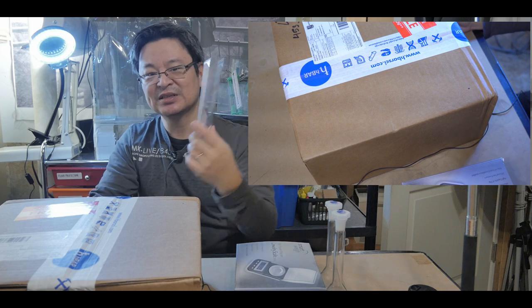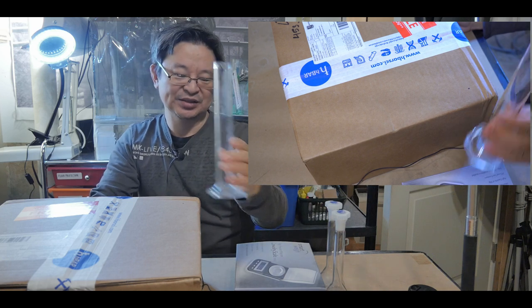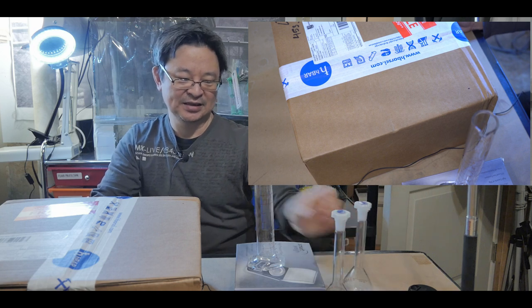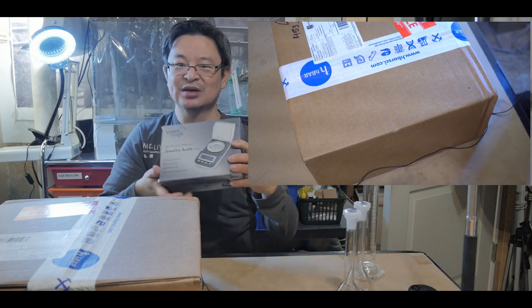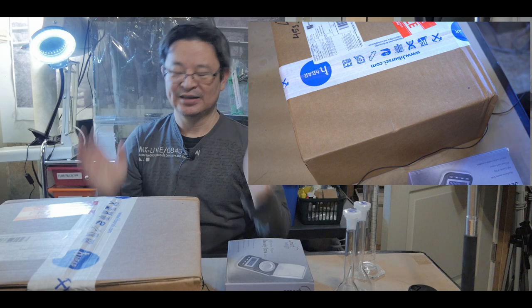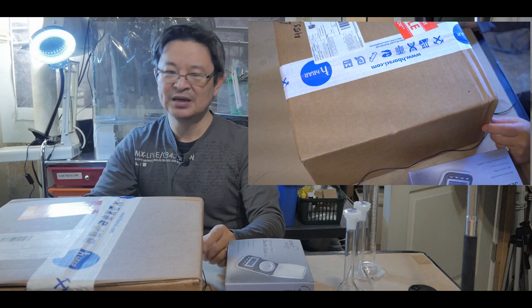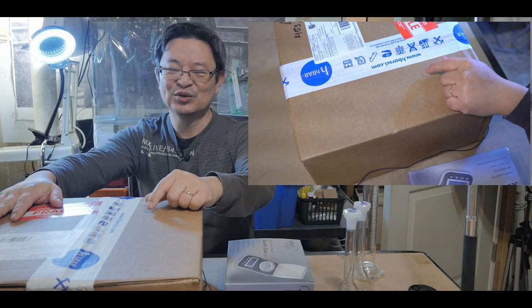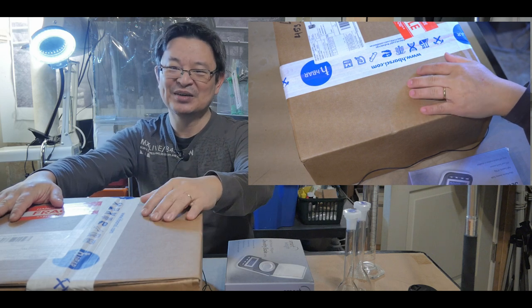Now one of my favorites is, of course, the graduated cylinder and the volumetric flask, as well as the electronic balance and the burette. But here we have a box that I'm going to open and show you again one of my favorite glassware.